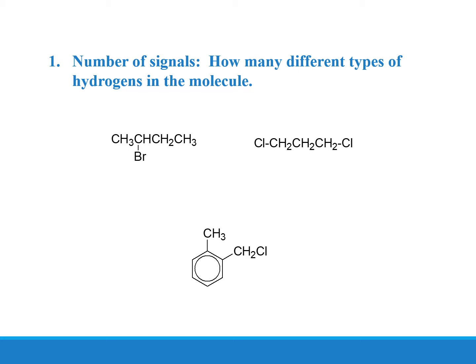But also you can see that we have the ring hydrogen atoms. These ring hydrogen atoms can be considered to be nearly similar, and they will have almost the same peak. So for this structure, we will have 3 peaks: one from the methyl, second from the methylene, and third from the ring hydrogens.